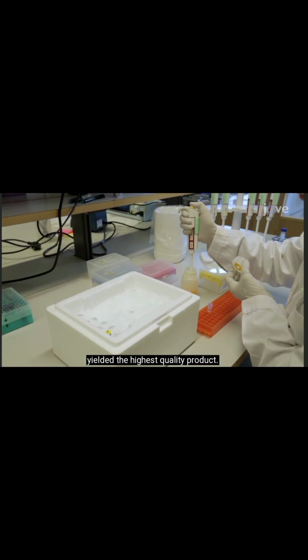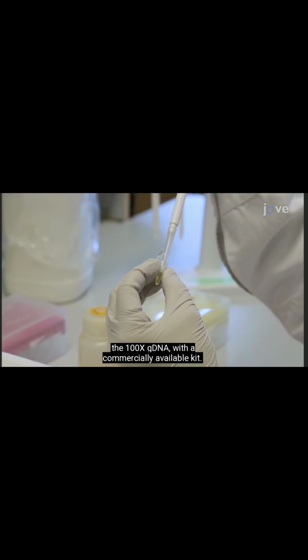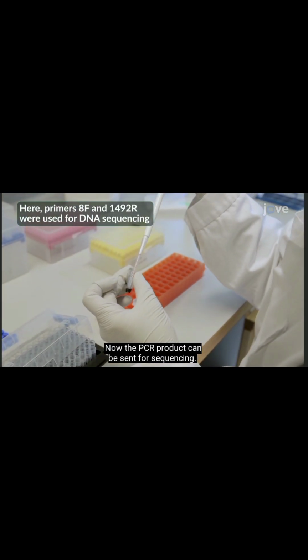A successful reaction using the described protocol should yield a single band of approximately 1.5 kilobase. In this example, the sample containing 100x diluted gDNA yielded the highest quality product. Next, purify the best PCR product, in this case the 100x gDNA, with a commercially available kit. Now the PCR product can be sent for sequencing.